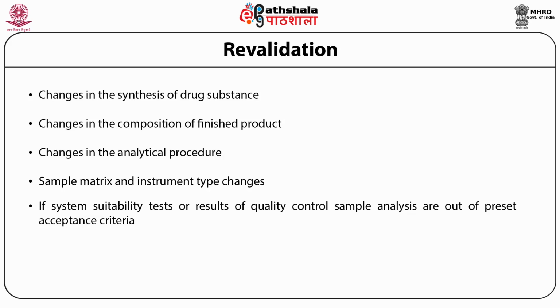For example, an aging ultraviolet lamp. A deuterium lamp has a limited lifetime. Six months before, I did an experiment when the HPLC was extensively in operation. Six months later when I go and do it, an aging deuterium lamp causes decreased energy continuum, which can cause a drop in the parameters and calls for revalidation of the method.